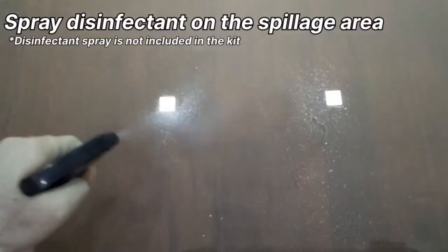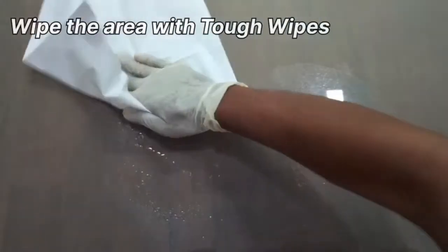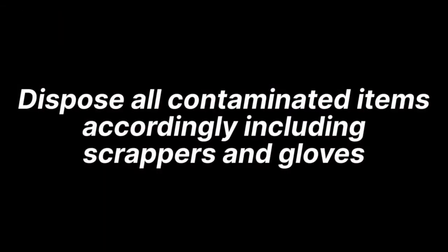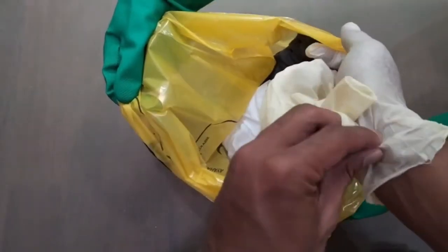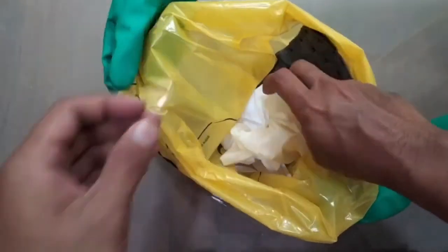Final disinfection and keeping the area dry not only prevents the spread of germs but also ensures a safe walking area. Ensure that all contaminated items are disposed of in accordance with local regulations. Let's be responsible citizens together!